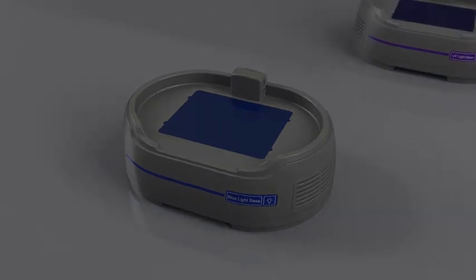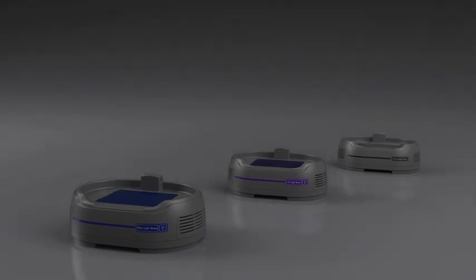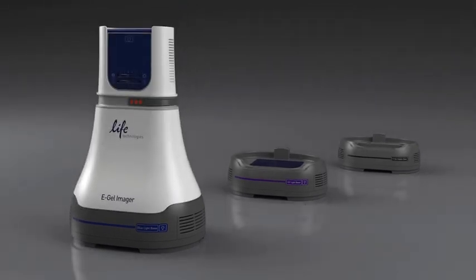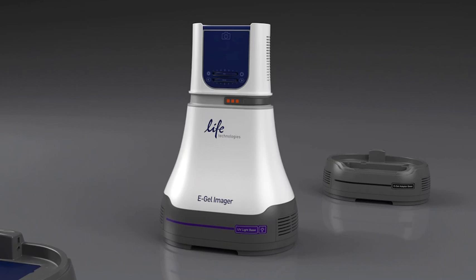The first component of the eGel Imager system is a choice of three interchangeable bases. The blue light base provides strong, uniform, visible blue light transillumination that can be used to excite innovative cyber dyes, like those found in eGel EX gels or in CyberSafe stain. Next, there's the UV light base, best for traditional ethidium bromide stain gels.